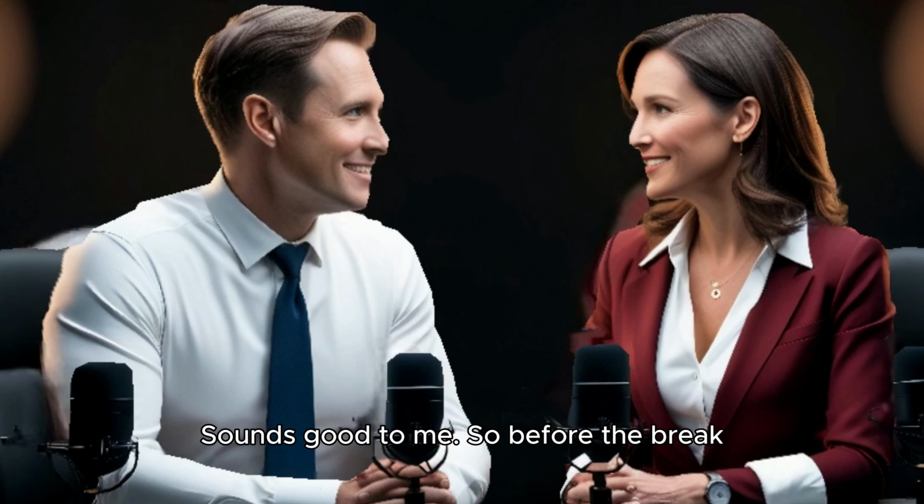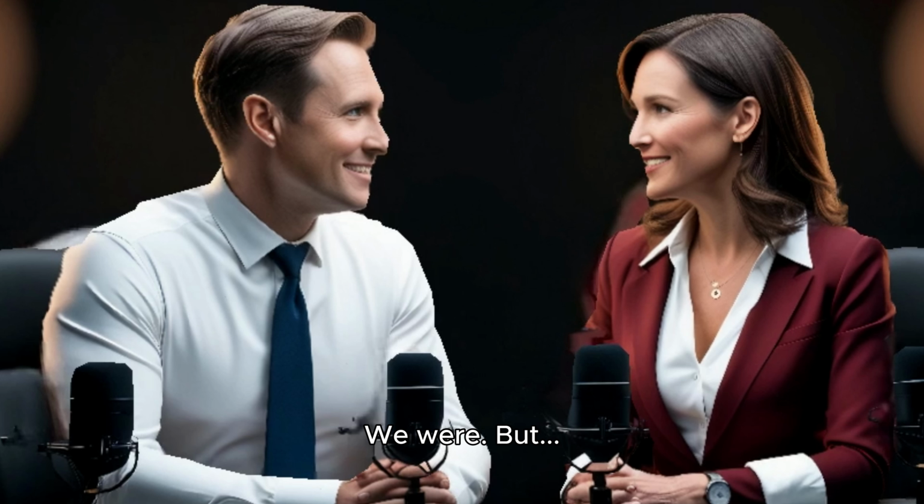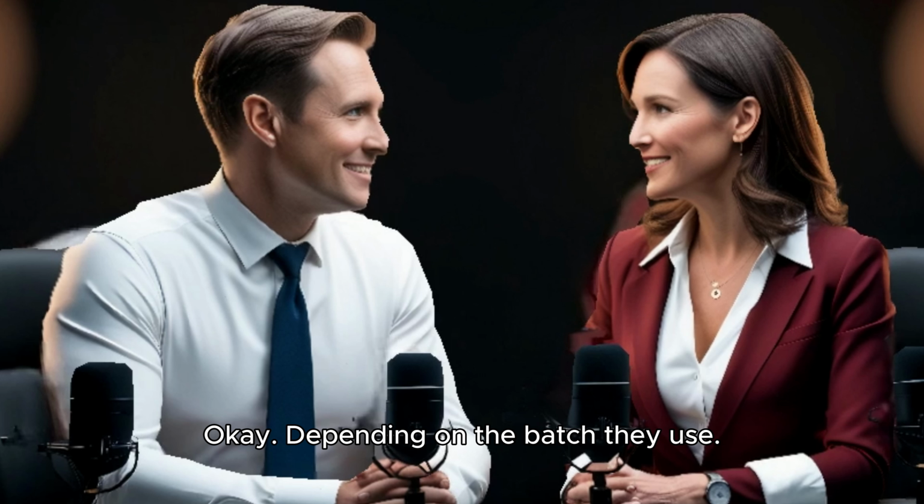So before the break, we were talking about how carbon-clad zirconia could be really useful for analyzing complex mixtures. But the paper also mentioned some variability with this material. They did find some inconsistencies. Can you talk a bit more about that? Wong and his colleagues noticed that the performance of the carbon-clad zirconia varied a bit depending on the batch they used.